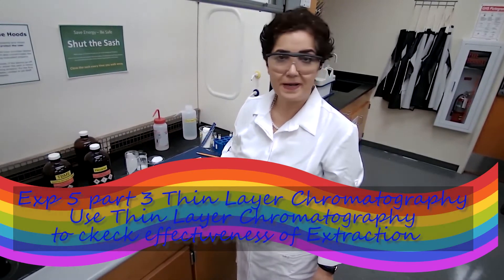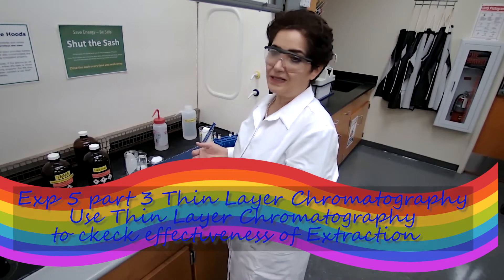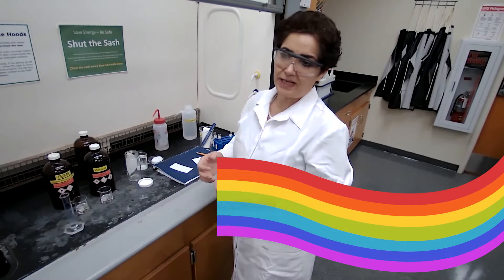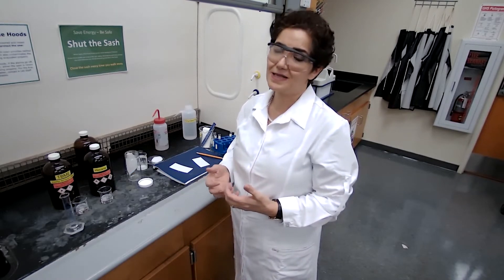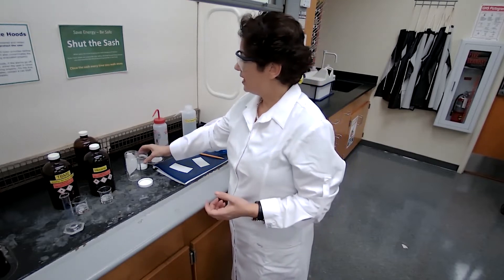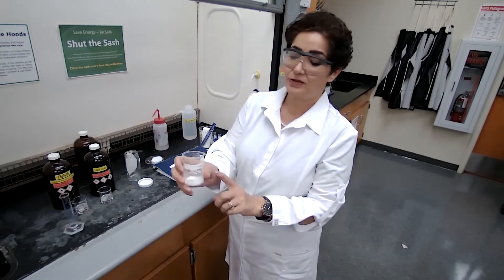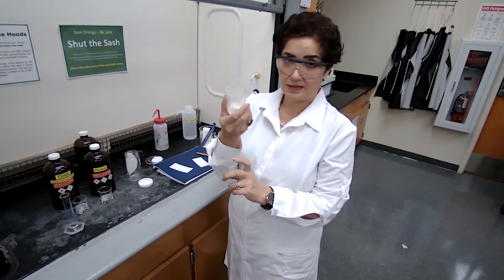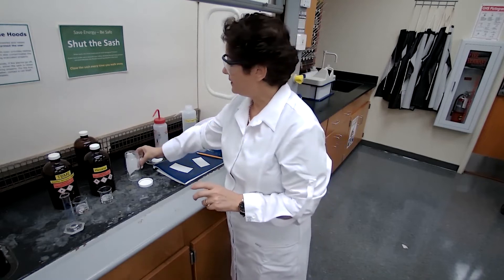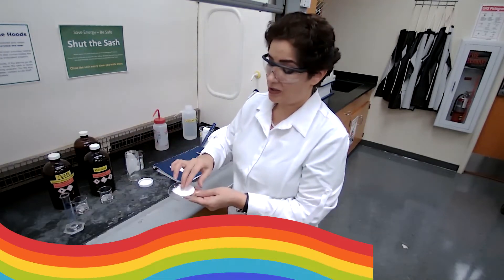For part three of this experiment for chromatography, we are going to use TLC to check the efficiency of the separation technique we used last class, and that was extraction. After the extraction, I told you to save your sample, which we have the neutral product inside a beaker and the acid, the organic acid on the watch glass.